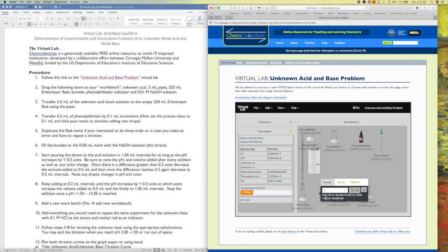So now it increased again by like 0.1. So I will go by 1 ml one more time. And that increased by 0.2, right? So that's it. I am decreasing the volume that I'm adding now. I'm going to go by increments of 0.5. And hopefully that will decrease the amount that the pH will go up by. But also remember that we might be getting near the end point. So we want to see when this flask is going to change to pink.